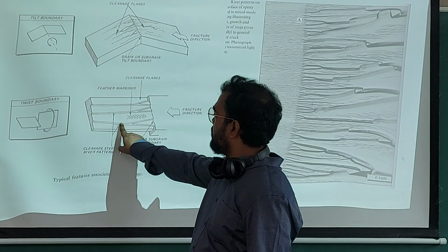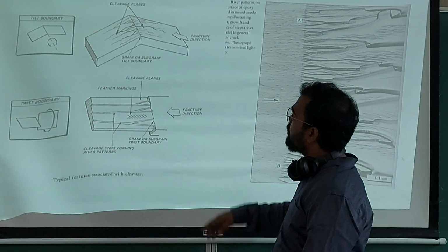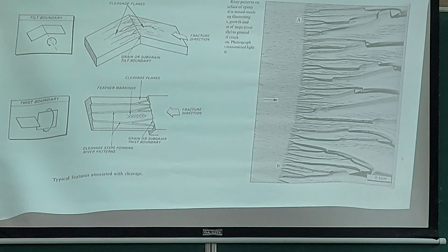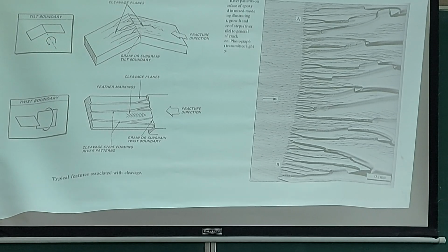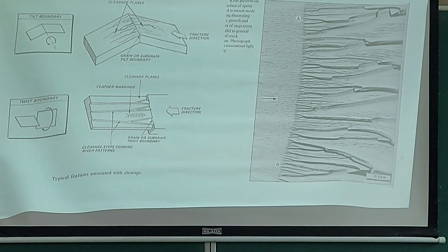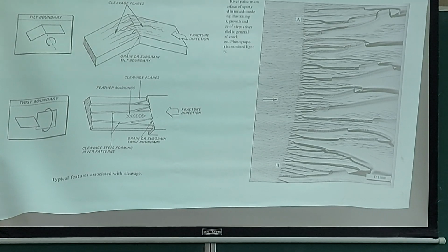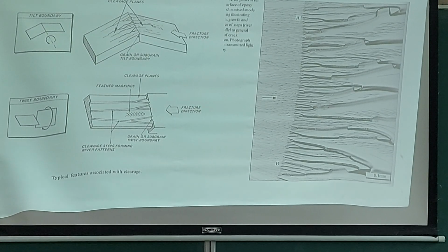And what are these, which look like rivers, also called river lines. So there is no dimple here, it's a brittle fracture. Okay, so void formation is not there. Even if it is happening, they are not the ones which are deciding the fracture.